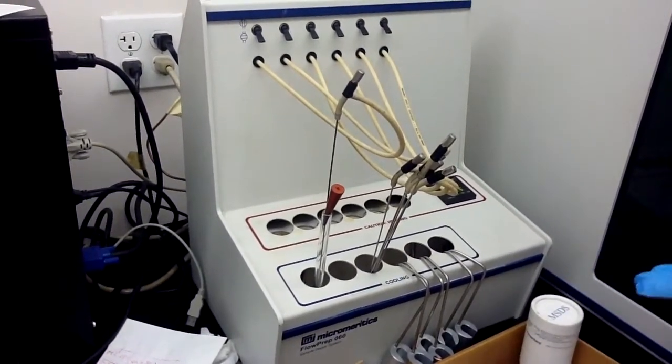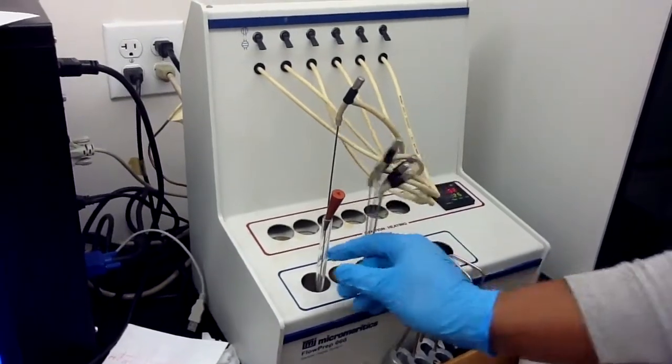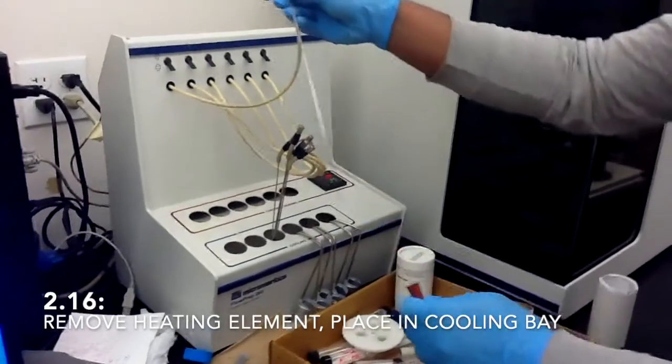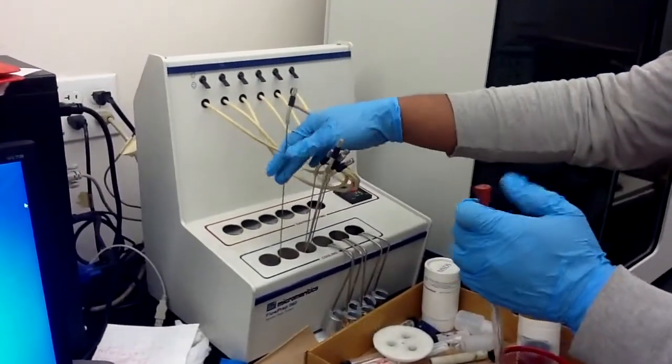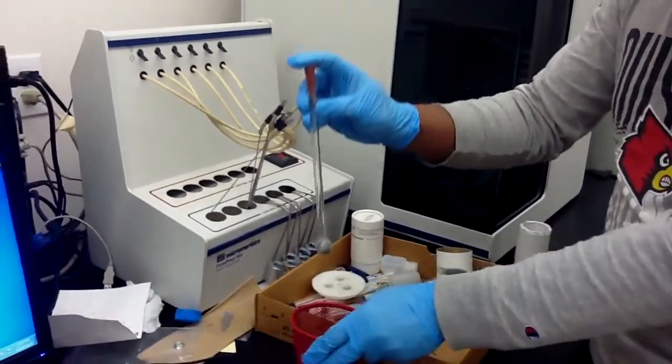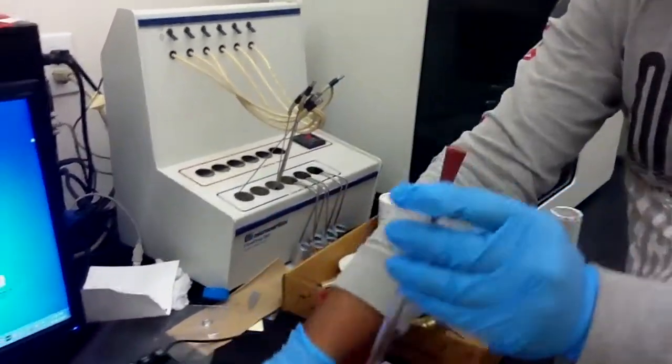After cooling down, you will take this rod out and again use the balance and measure the weight. So this is your weight now.